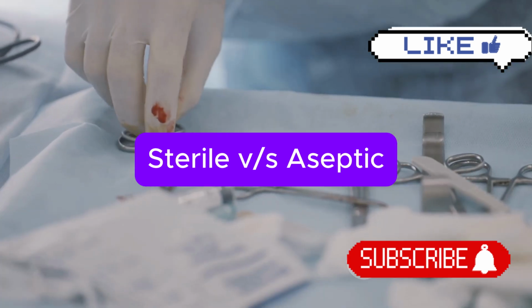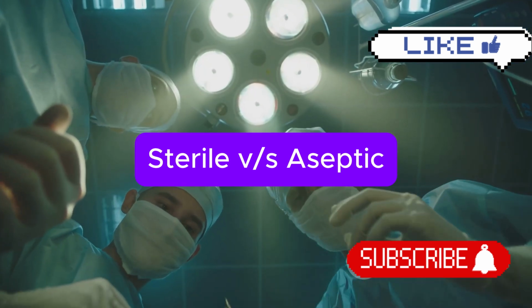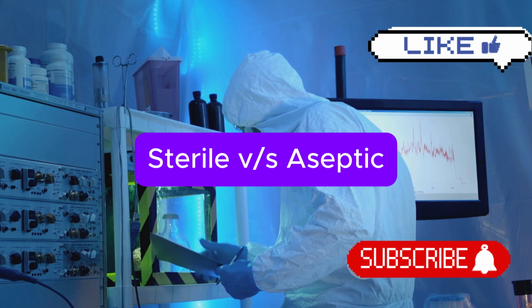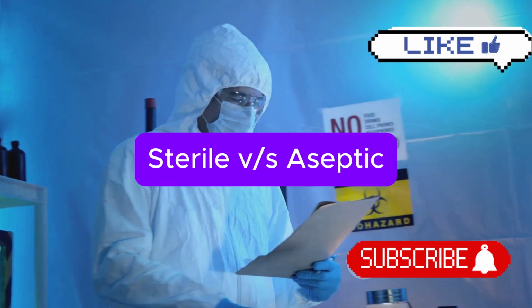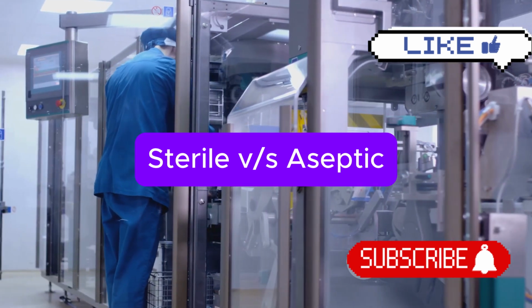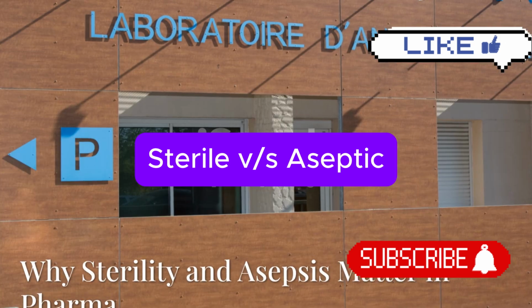The surgical instruments need to be sterile, meaning entirely free from microbes. The operating room itself doesn't need to be completely sterile, but it does need to be aseptic. This means controlling the air quality, cleaning and disinfecting surfaces, and ensuring the surgical team follows strict protocols to minimize the risk of contamination. Understanding this distinction is vital in pharma. While some products require complete sterility, many others are manufactured in a controlled aseptic environment to ensure their safety and efficacy.